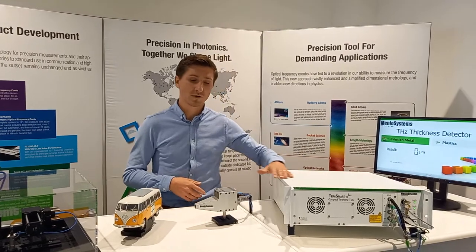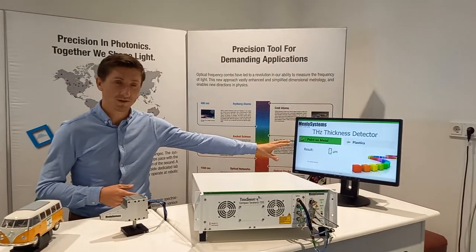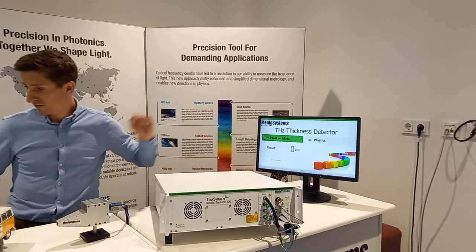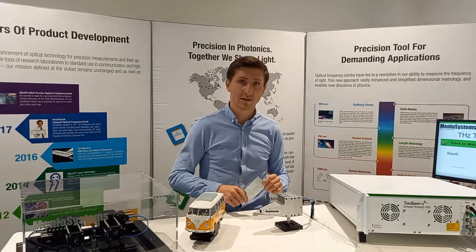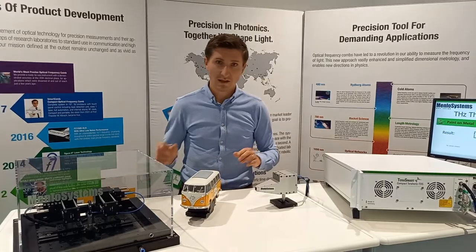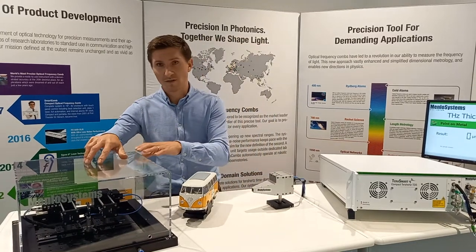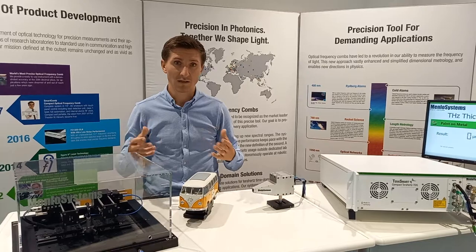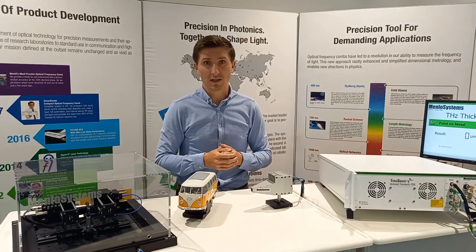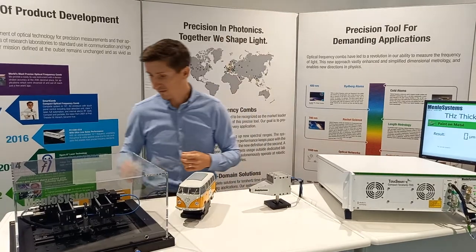Today we are using a TeraSmart system to show you a thickness detection algorithm. I have the software already opened here. You can see there's a difference between measuring paint on metal and also measuring plastics. To set up and calibrate your system, I'm using this simple metallic plate for calibration. Aside from the reflective setting, all transmission settings are available from Menlo Systems for spectroscopic applications with highest resolution, high Terahertz bandwidth, and extremely good dynamic range — up to 100 dB and 6 Terahertz of spectroscopic bandwidth.